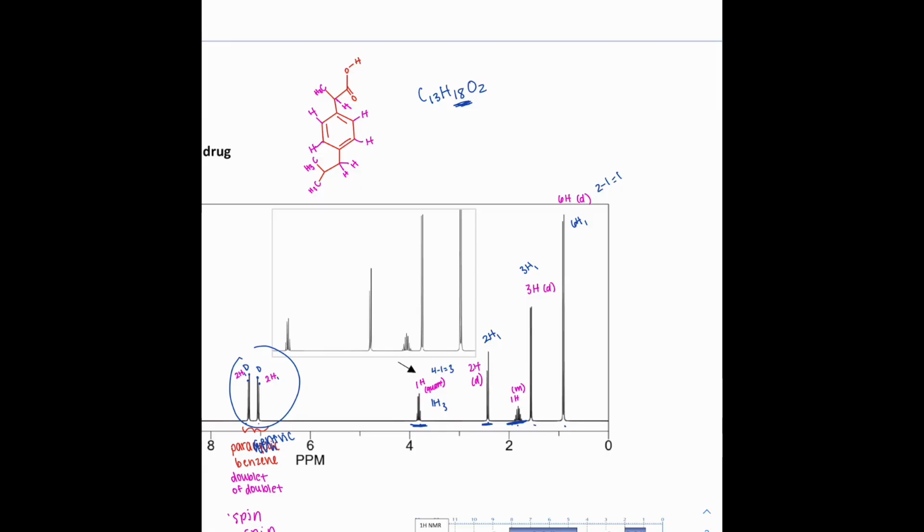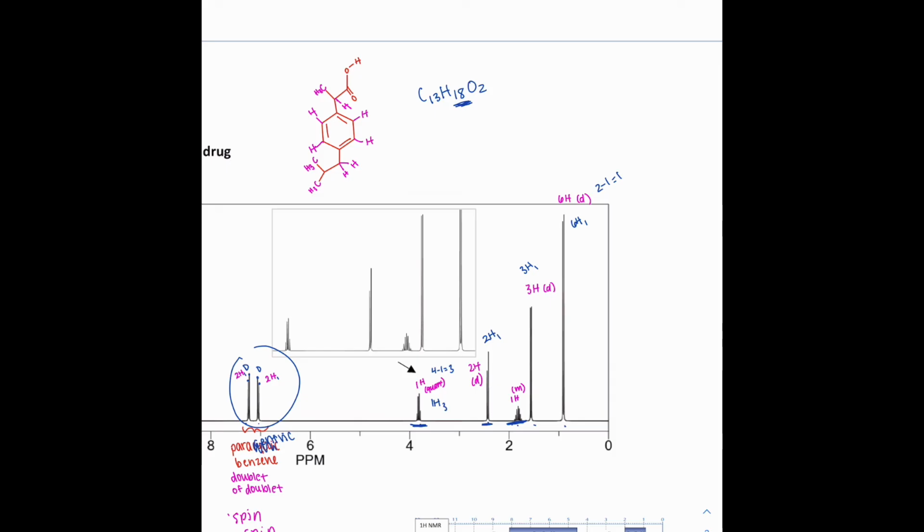And then moving on to that last one, we have 6 hydrogens with one neighbor, and our only option left is these 2 methyl groups. So we have 3 plus 3, each methyl group has 3 hydrogens, equals 6, so that matches with the integration number. And then right off of that carbon, because these 2 are in the same environment, they have that one singular neighbor, that implicit hydrogen that was not originally drawn out. So that is how to work through the NMR.